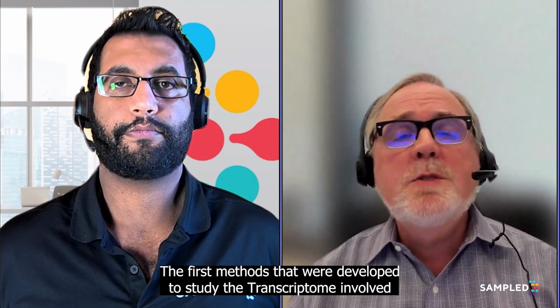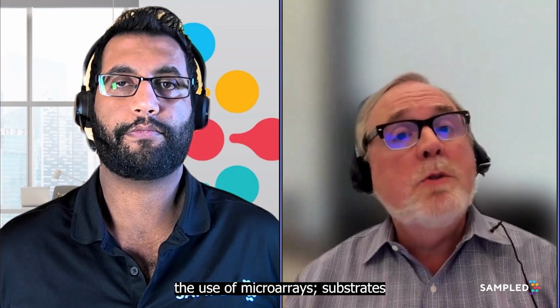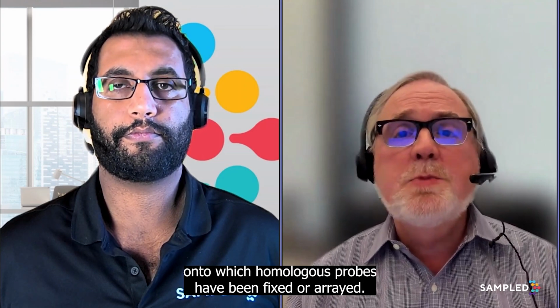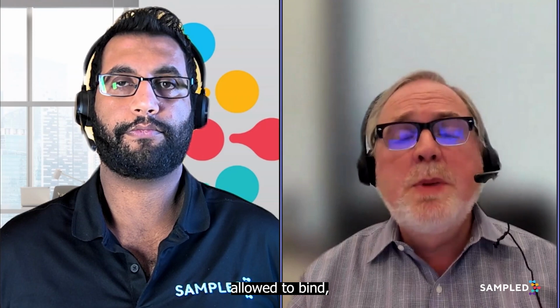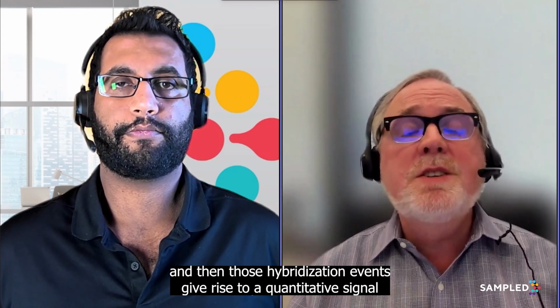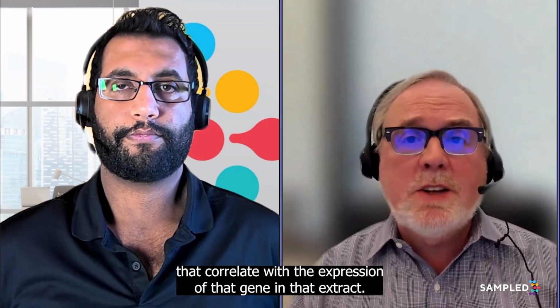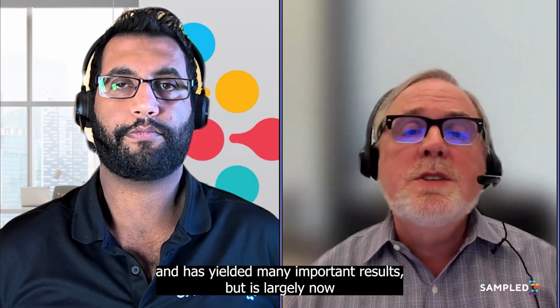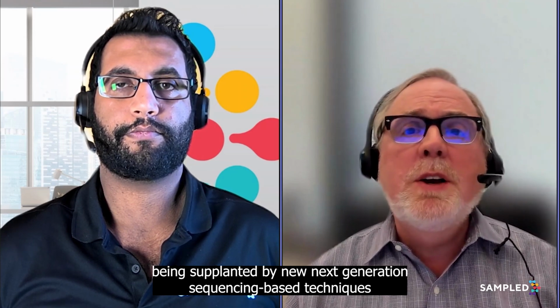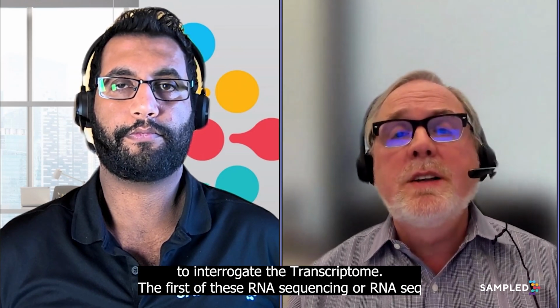transcriptome. The first methods that were developed to study the transcriptome involved the use of microarrays, substrates onto which homologous probes have been affixed or arrayed. Extracted RNA from cells or tissues is then hybridized to the substrate, allowed to bind, and then those hybridization events give rise to a quantitative signal that correlates with the expression of that gene in that extract. Now, microarray technology is very powerful and has yielded many important results, but is largely now being supplanted by new next generation sequencing based techniques to interrogate the transcriptome.